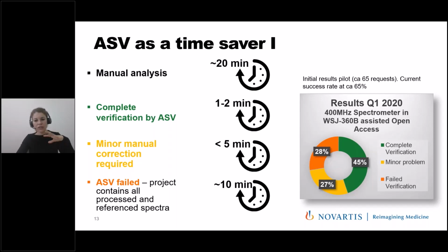We are now around 60 to 65% success rate at the moment after 2 years. So we've really seen an increase in the green results, and the software really seems to be learning, of course, as we feed more data into it.